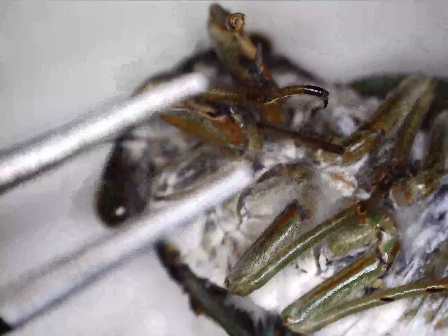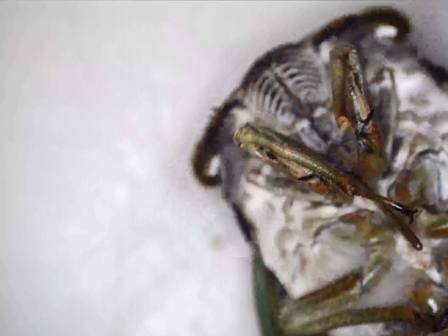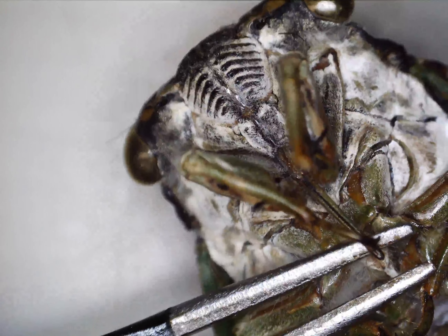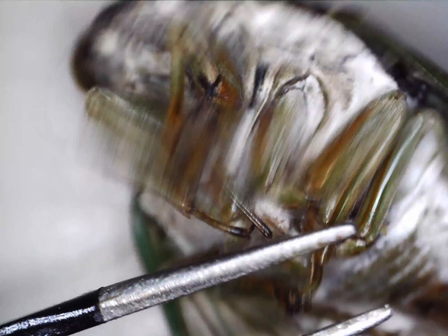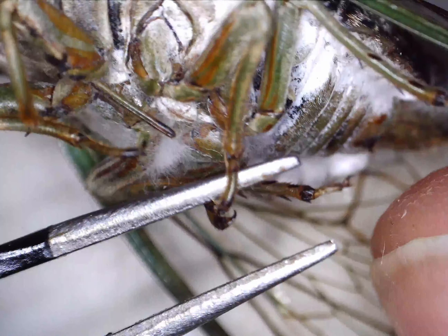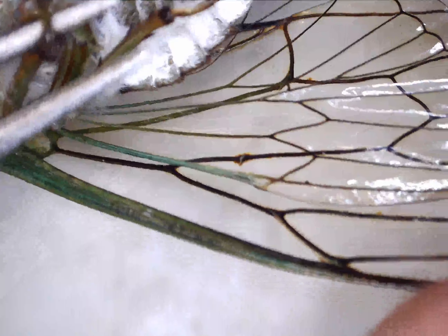This is what they look like — they've got little pincher legs to grab onto limbs, there's their mouth that they kind of use like a straw to reach in and draw sap from trees. Their legs have a little bit more hooks on them than in the larva stage because they're climbing instead of just burrowing. And nice wings with a nice wing design.